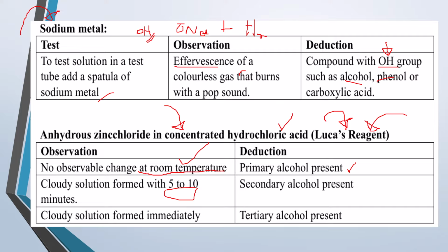So it's as simple as that. That is going to confirm presence of a secondary alcohol. And if the cloudy solution forms immediately, that confirms presence of a tertiary alcohol.